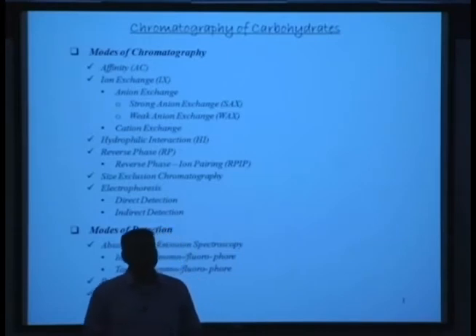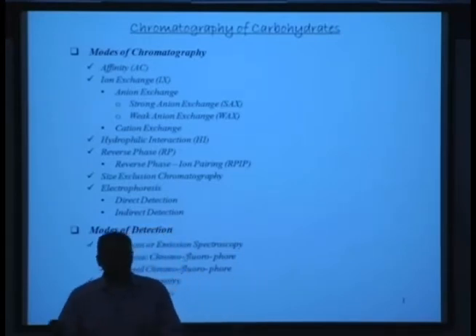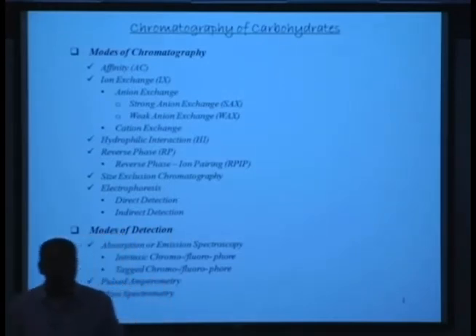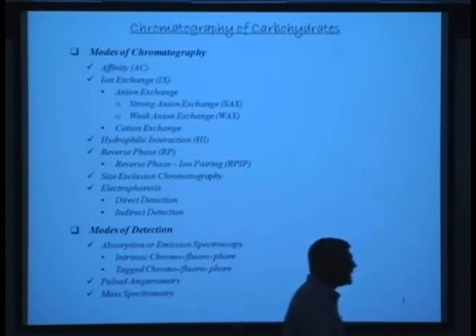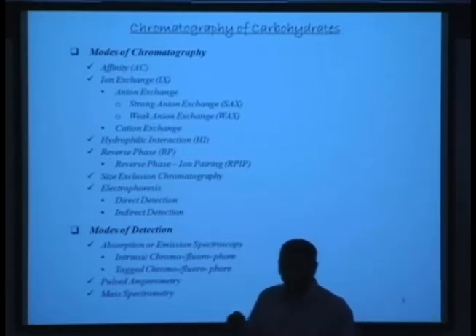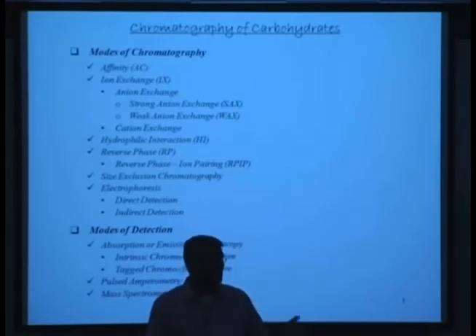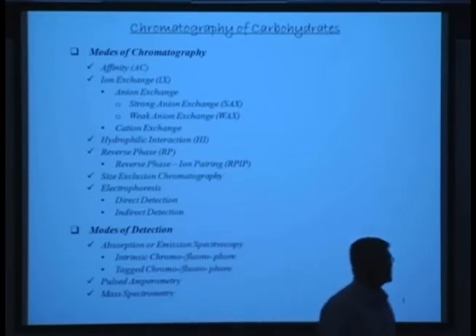Okay. What about other functional groups in carbohydrates that you know of? Aldehyde. Let's say there are aldehydes, assuming that you do chromatography of monosaccharides, for example.